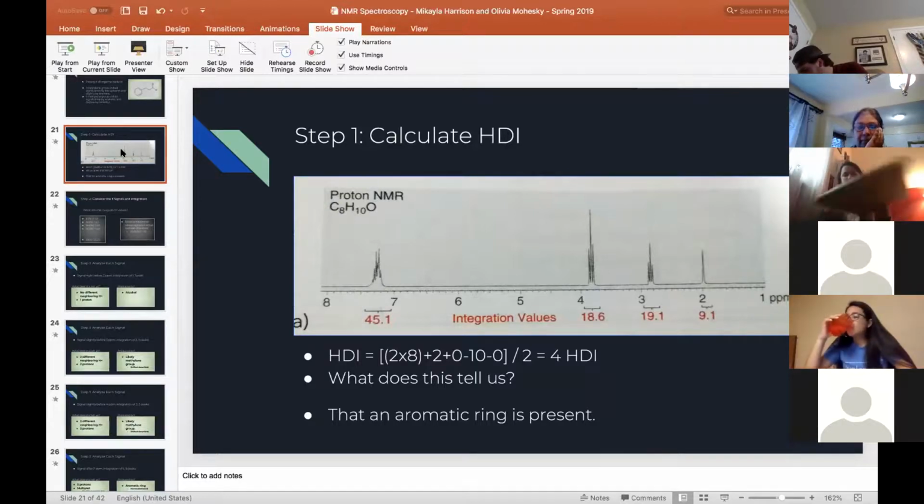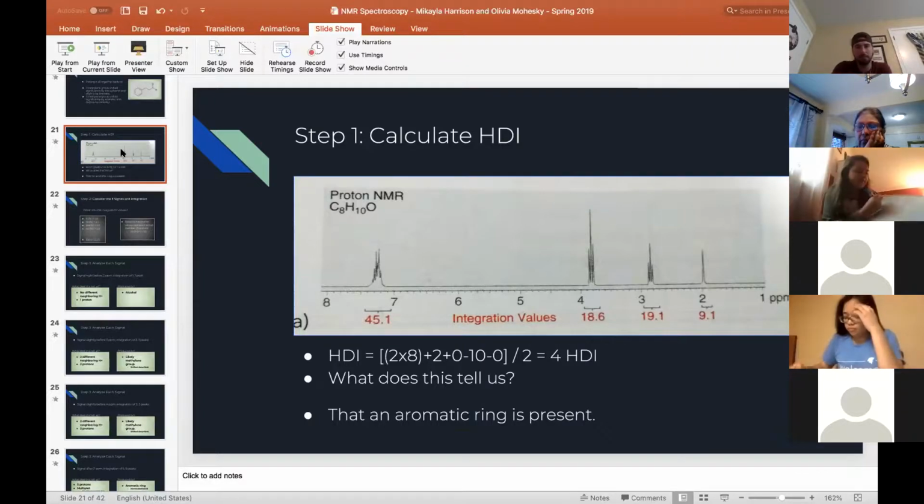Yeah. Okay, so the next one's around 3 ppm. I'll show you guys this after I write it out. And then it's a triplet. And when we divided it by 9.1, it showed us 2 hydrogens. So this is all the information that I've gathered now for that second peak, for this peak right here. Can you see that, or how should we make that better?